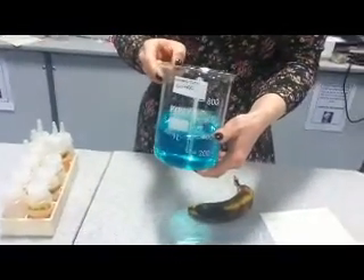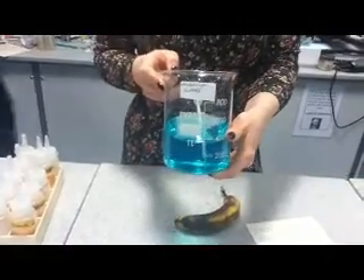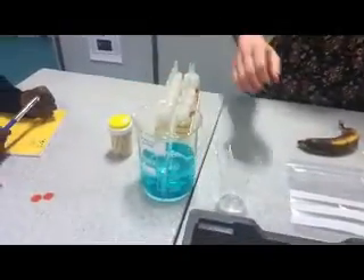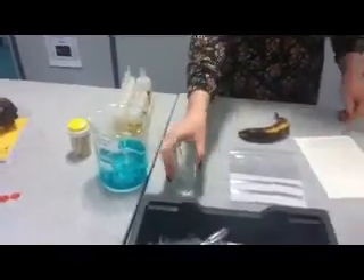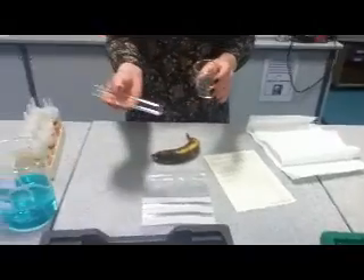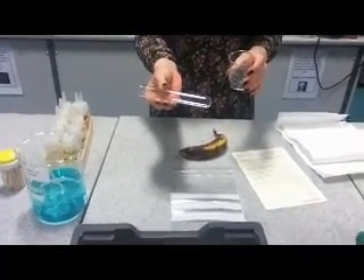In here we've got a combination of washing up liquid and distilled water. You need a pipette, which I've left in there ready, a small beaker, a paper towel, and a test tube — we're using boiling tubes. They're a bit easier to use because they're a bit wider.